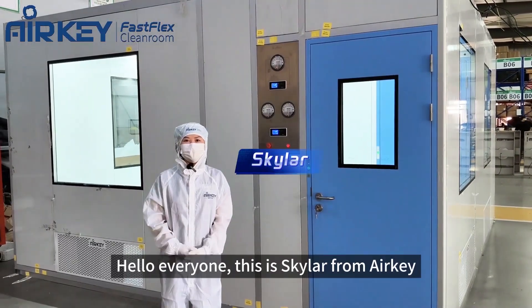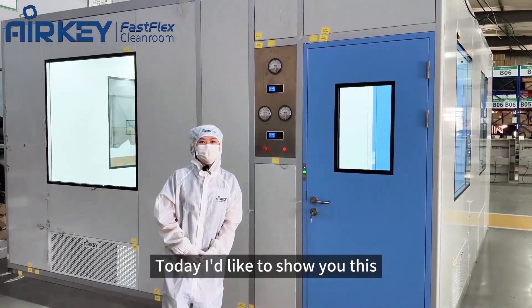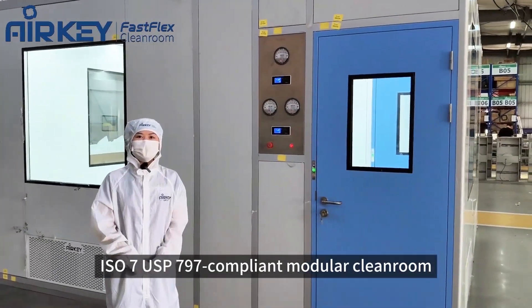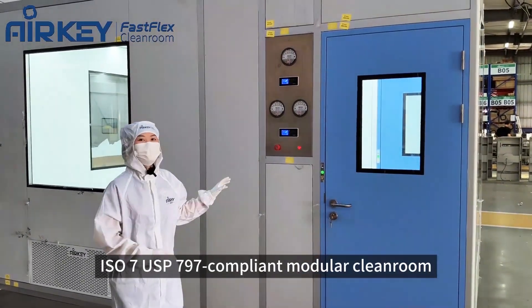Hello everyone, this is Skylar from AirKey. Today I'd like to show you this ISO 7 USP797 compliance modular clean room.